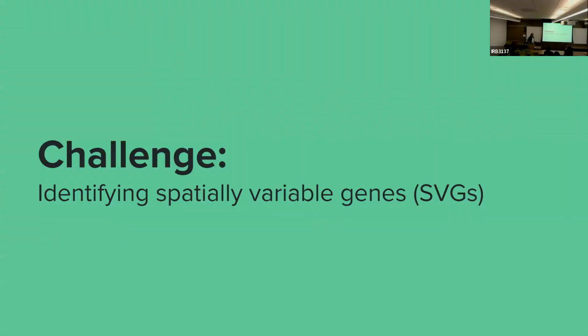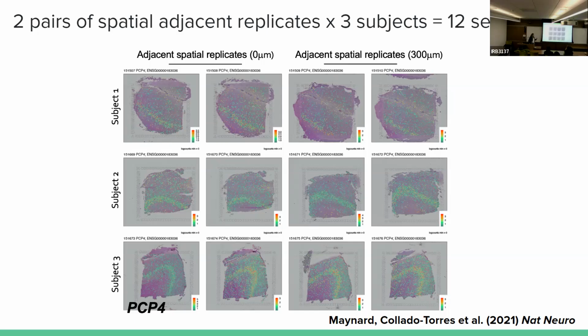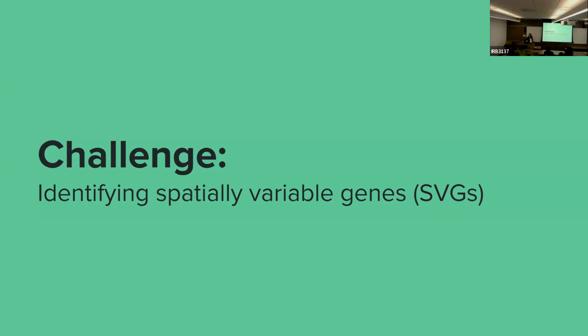So one of the challenges that I'm interested in is how can we computationally identify these genes? This gene, I've cherry picked for you. I'm trying to make a case that this is an important gene, a spatially variable gene. But I want to computationally identify the genes that are varying in a non-random way in 2D space. So that's what spatially variable gene detection is.